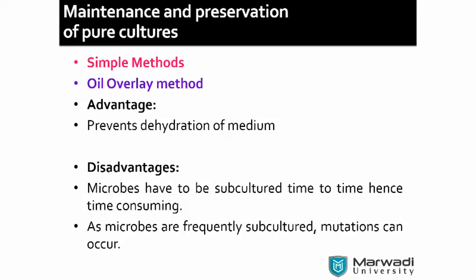Because of it, what's going to happen? The water vapors may reduce. As the water vapor reduces, your medium, which is like water, starts to transpire. From the water medium, transpiration may happen via the cotton plug, going into the freezer. Within the freezer, the sucking pump is going on. So after a certain time period, the medium you kept in the freezer became like one simple thin layer. Papad જેવું થઈ ગયું એમ કહી. So why is it happening? Because the water has started to get depleted.